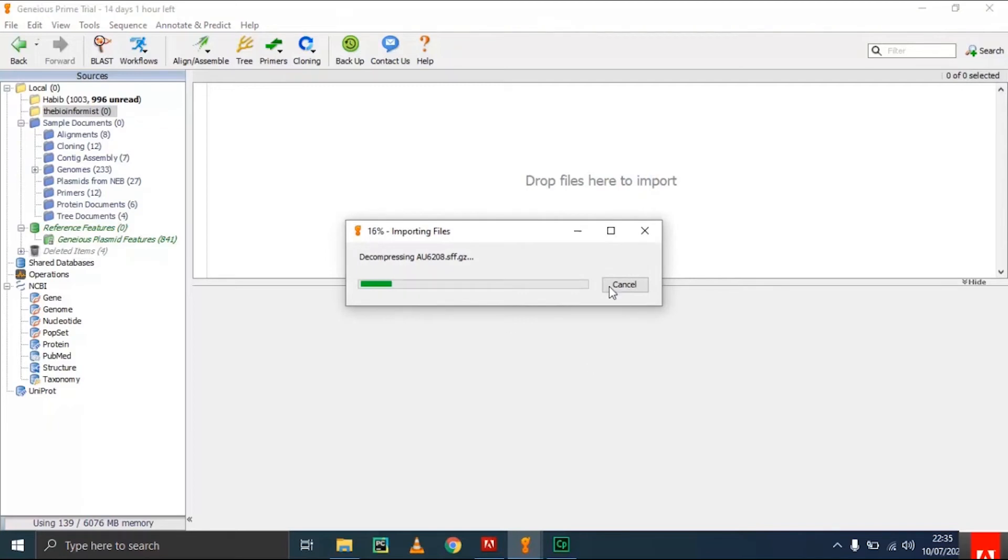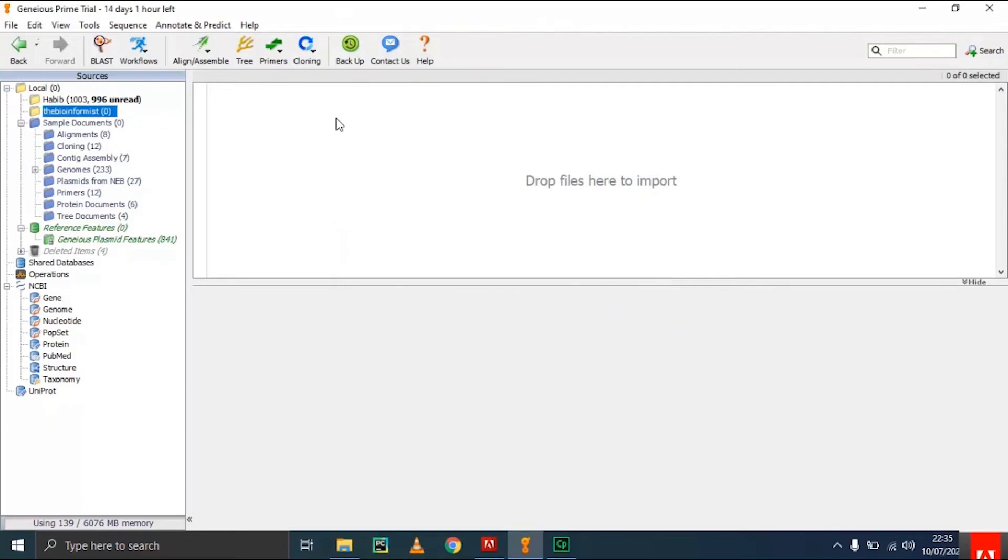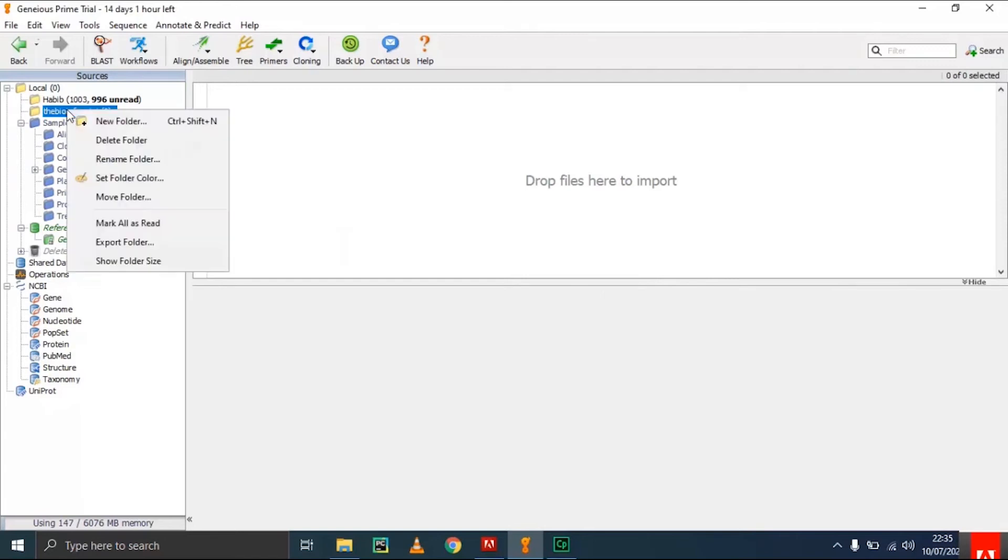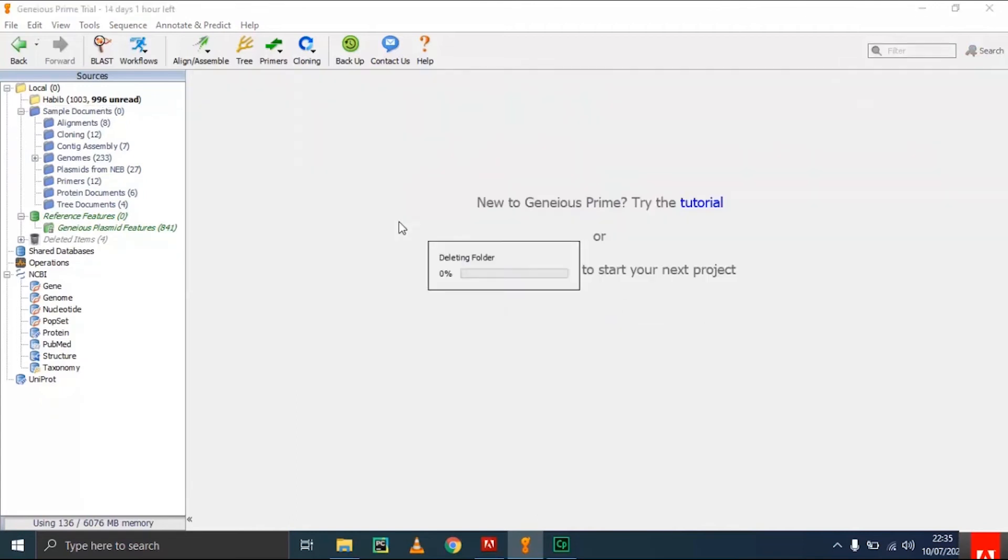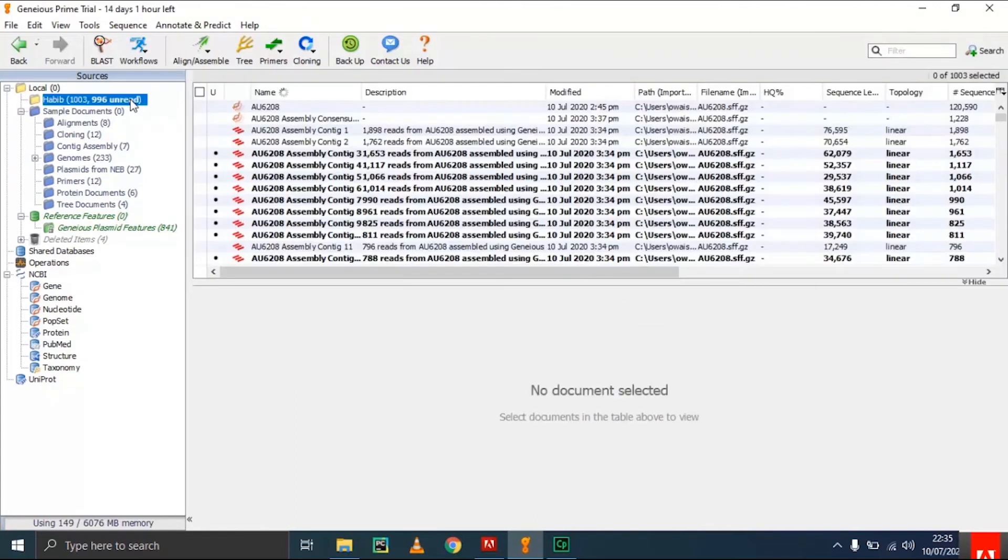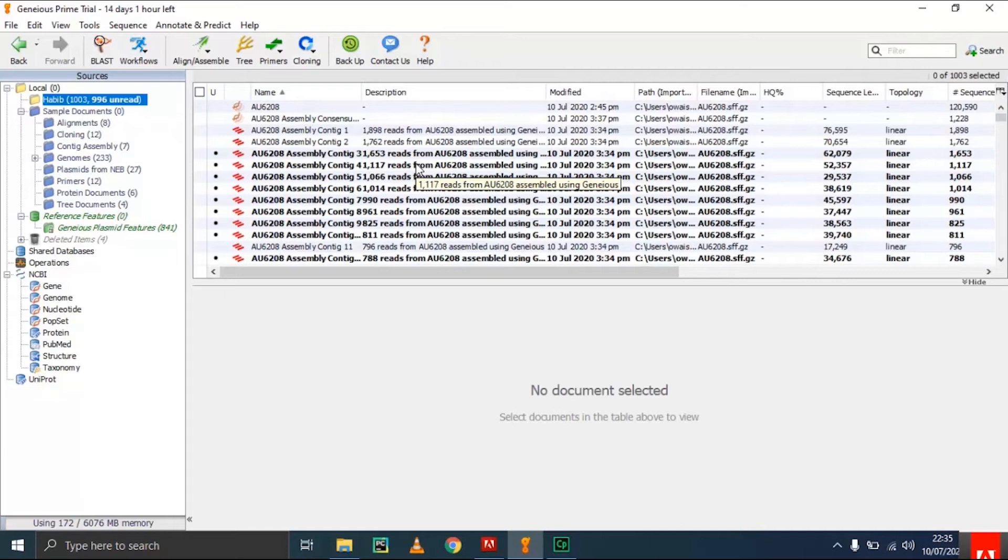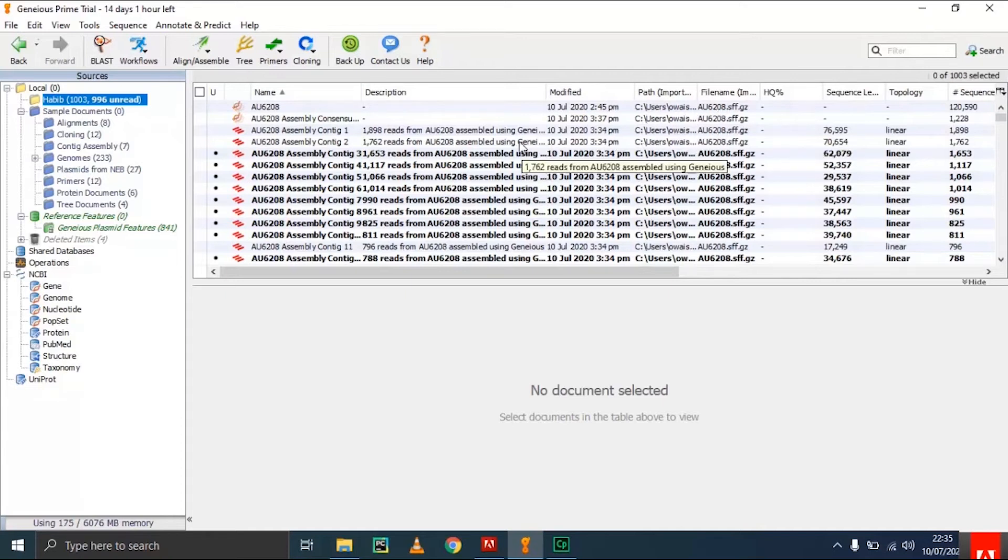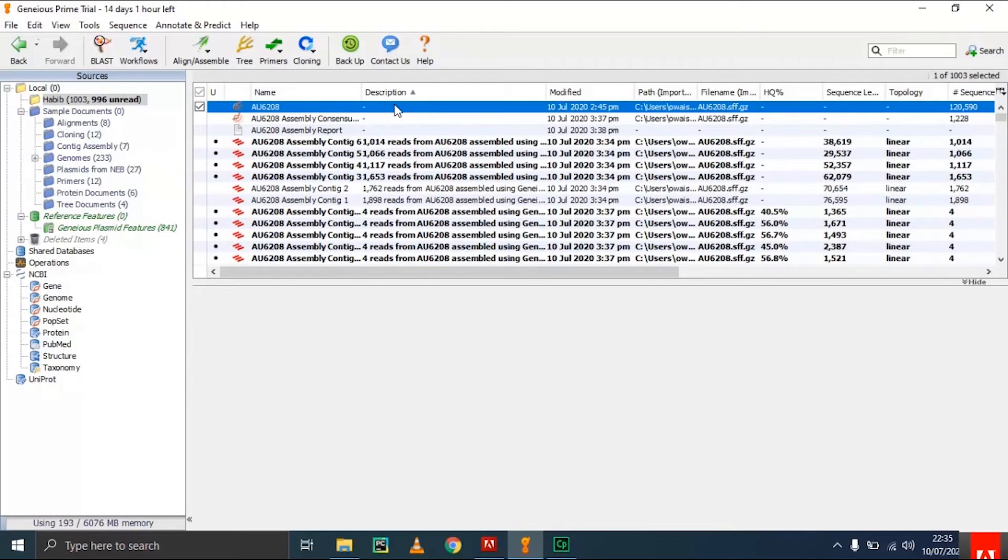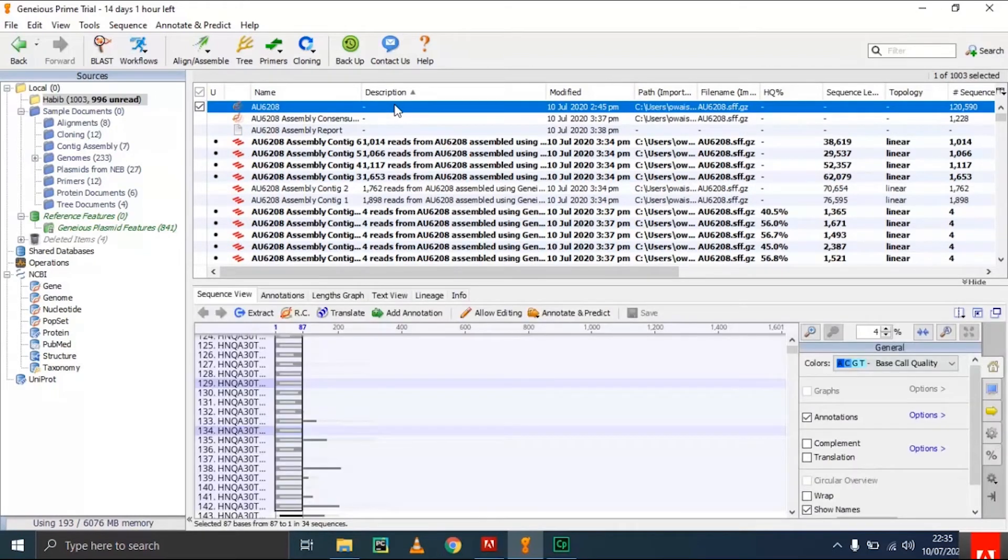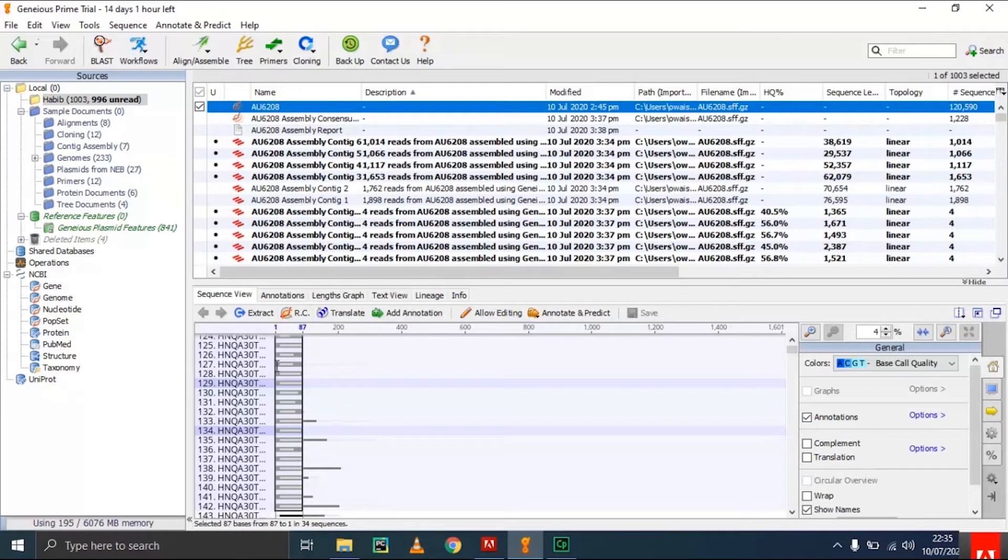I'll cancel the importing as I have already imported the file. It will take some time, so to keep the video short, here's the folder I created with my name containing the file with multiple read sequences. We got the file, but it's not the original file—it's after the assembly. When you get the file initially, you get a single file containing the sequence view of multiple small reads.